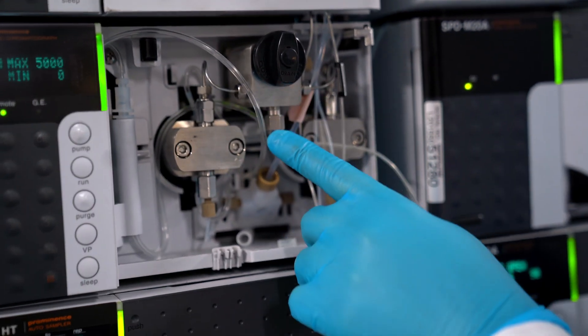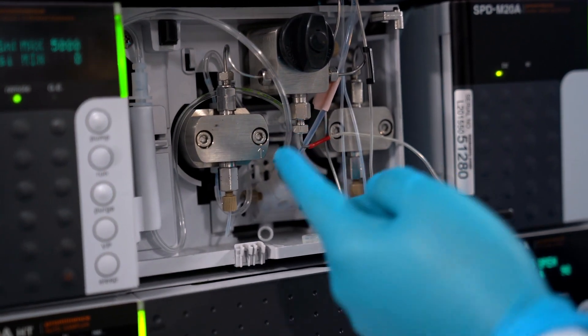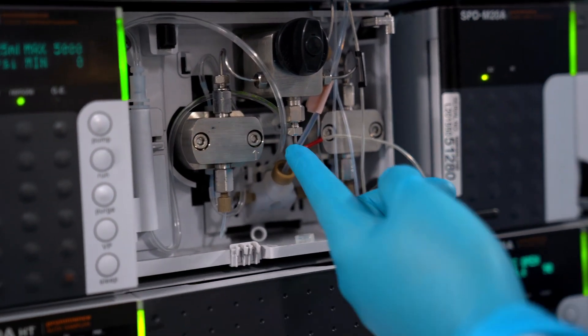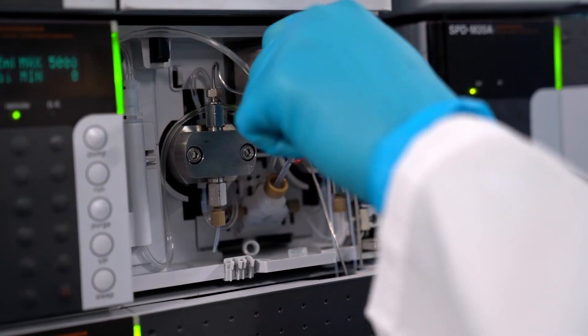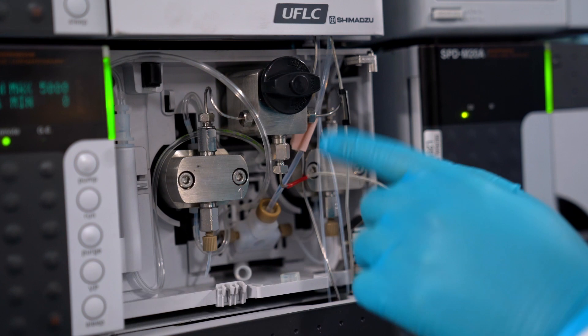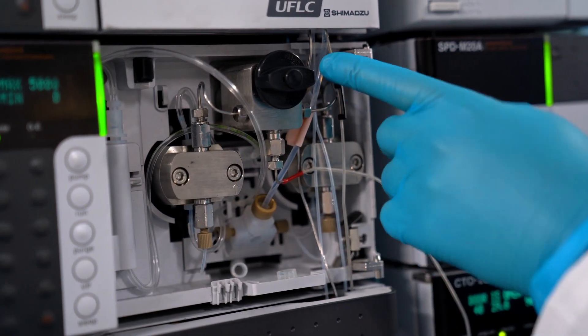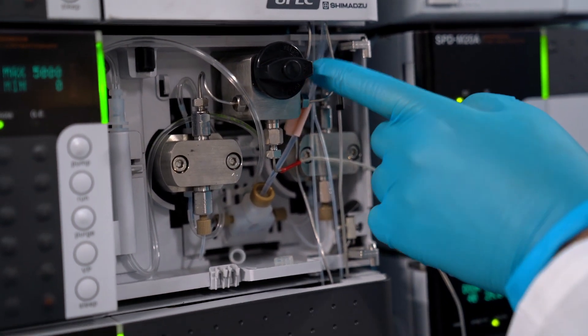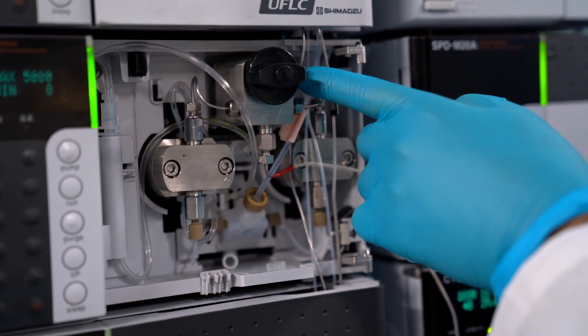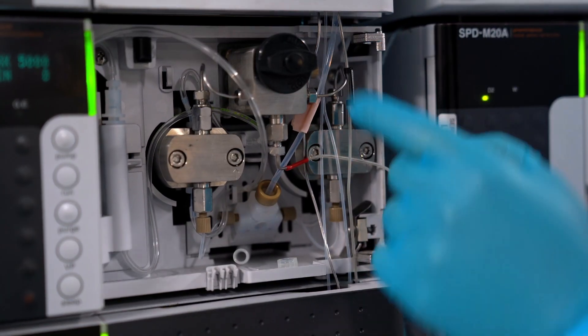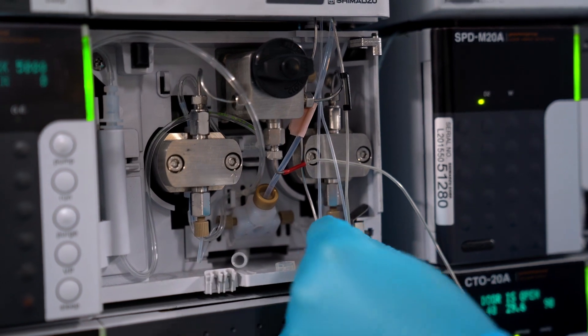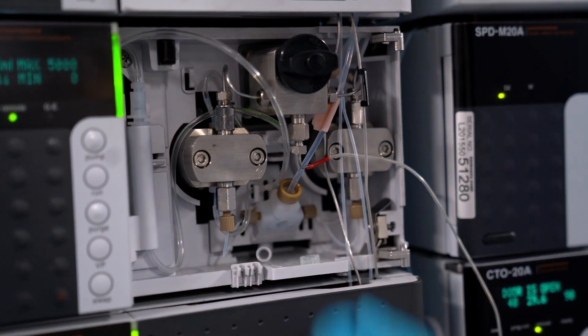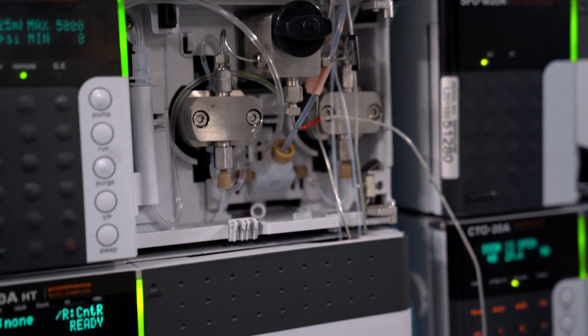If the drain valve is closed it'll go down here and then go to the mixer. If the drain valve is open then it's going to come out the side right here. This is the tubing for the drain and it'll go out here to the waste.